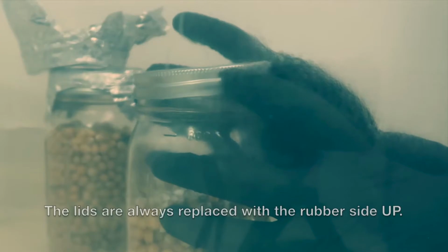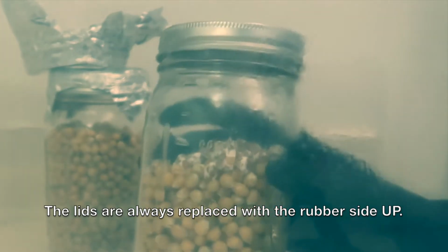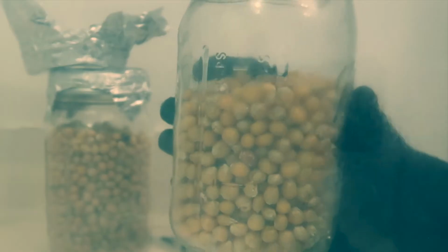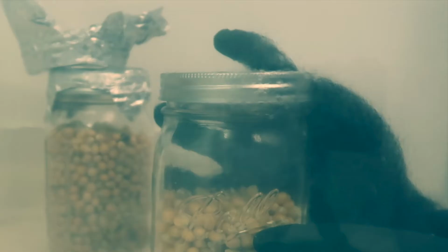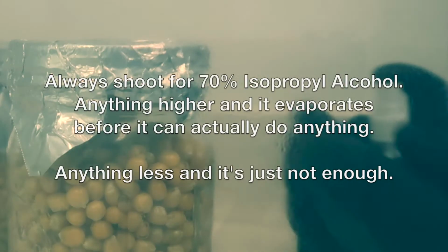Same idea here. I'm going to put the lid on and I will tighten it just for a second so that we can mix these colonized grains around with the uncolonized grains. And now that's going to increase the amount of inoculation points all throughout the grains for faster colonization. I'm going to loosen the lid just a little bit past finger tight so it can breathe. It's not completely sealed because again our actual lids are upside down so the seal is away from the jar. And I'm going to replace my dust cover. And now the grain-to-grain transfer is done. And now we can move on to the spore syringe inoculation.